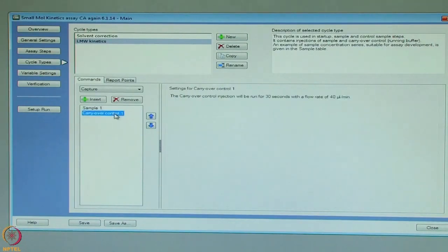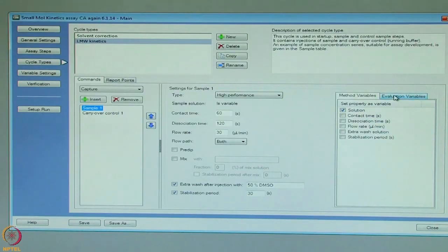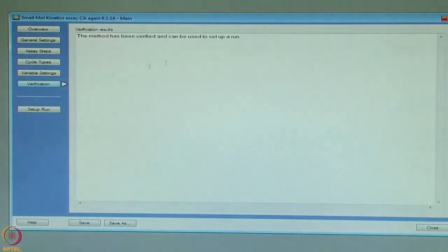Also, there is a carryover control injection will be given at a flow rate of 40 microlitre per minute. Similarly, the sample solution is a variable here. Also, the concentration and the molecular weight are variable here. So, we go into the verification mode and see that the method has been verified and can be used to set up a run.